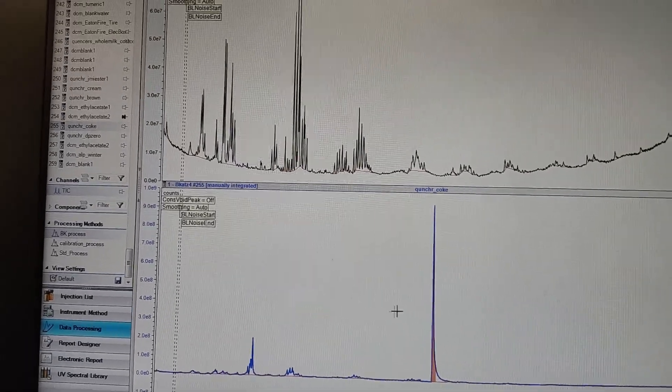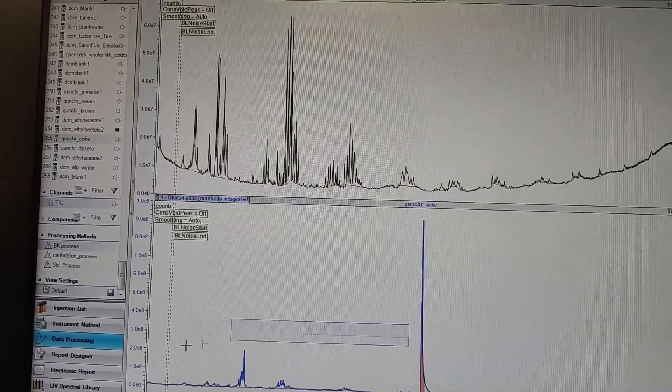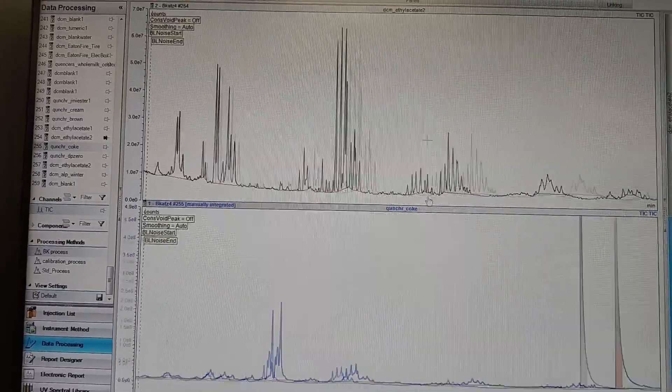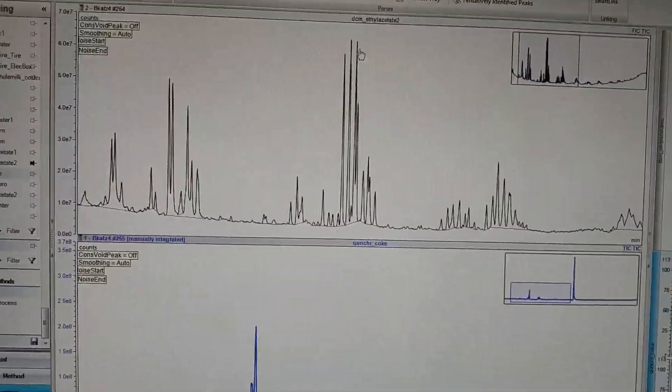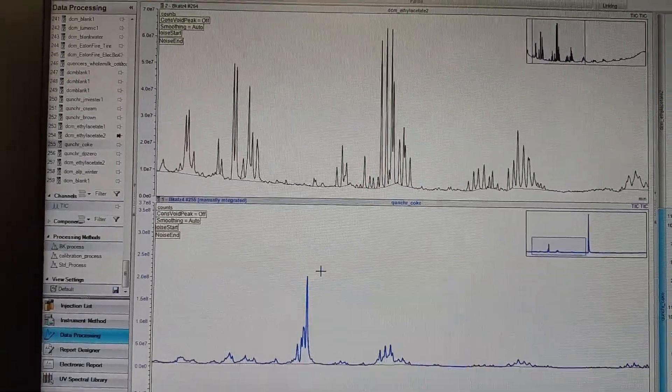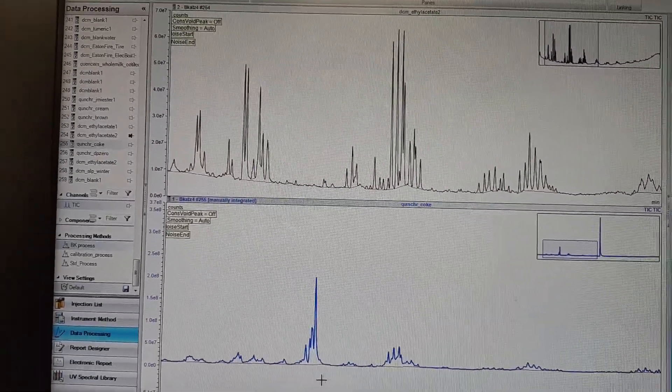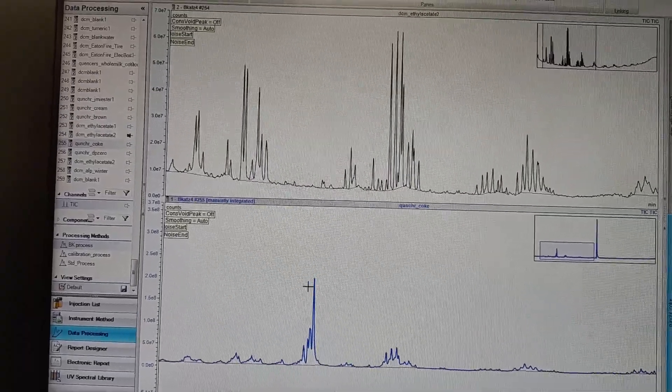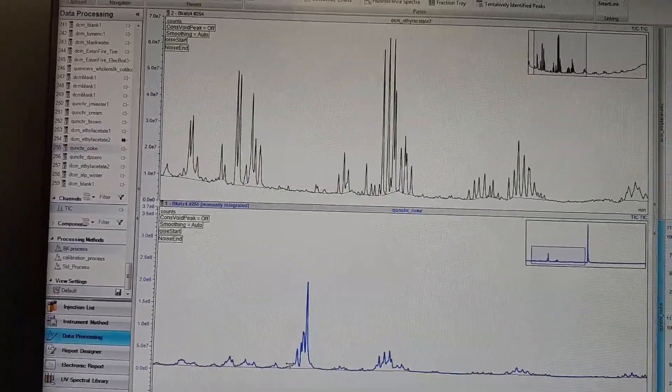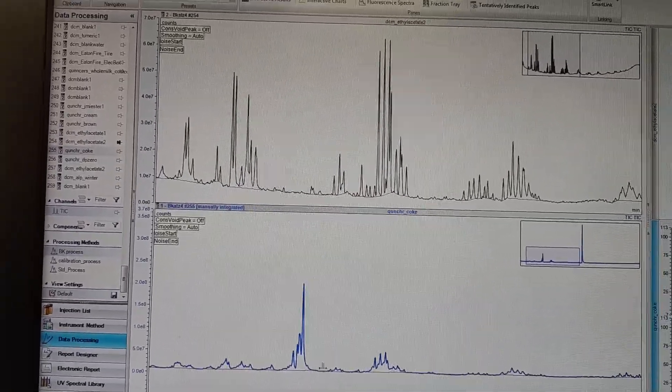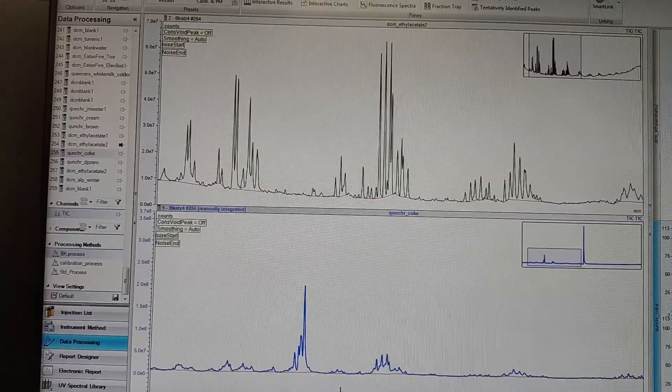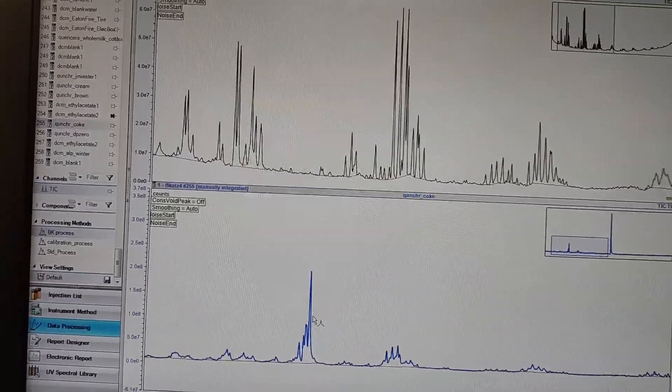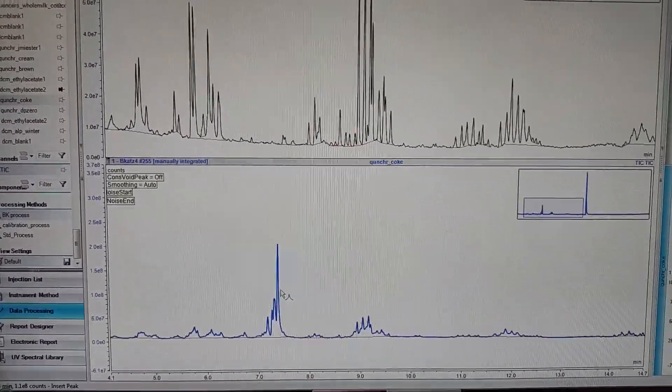You can see lots of caffeine, and then we got all these flavors. You got to watch out because it's pretty dirty, but there's this terpene blob that contains most of the flavors, and I can sort a few more out of here. I'll go ahead and do that and make a list.